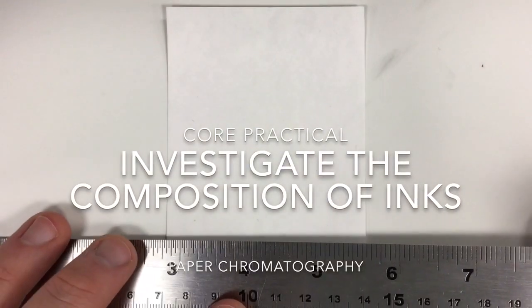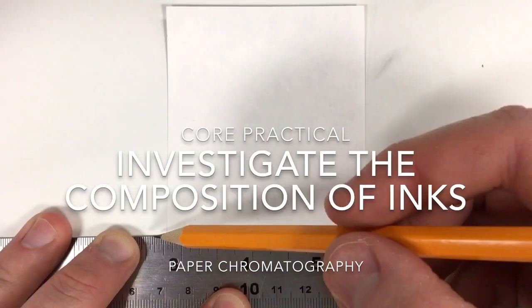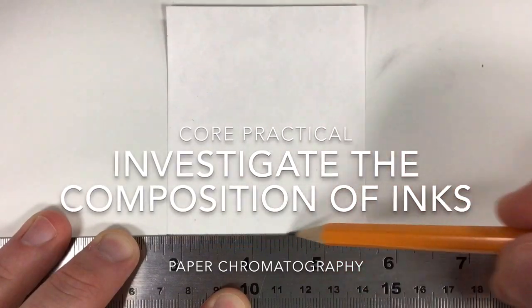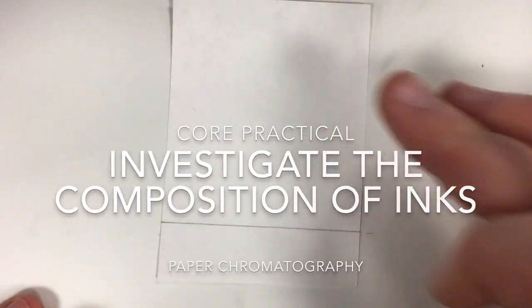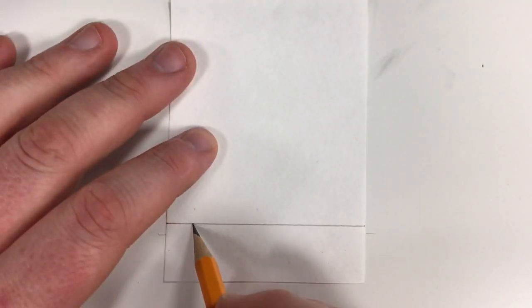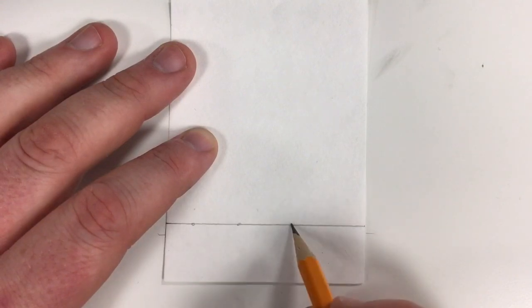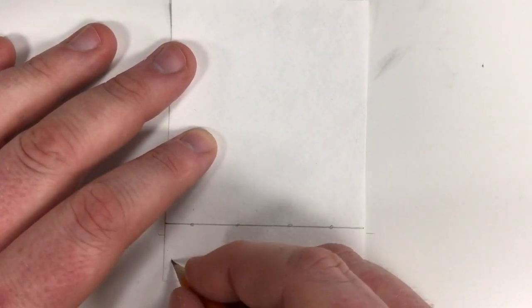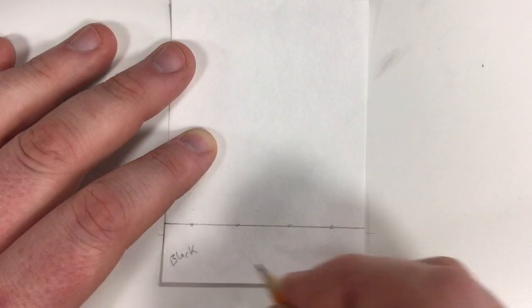In this experiment we will investigate the composition of inks using paper chromatography. Firstly we must define our origin by drawing a line using a ruler roughly one centimetre up from the bottom of the chromatography paper. This must be done in pencil as the pencil is insoluble in the water solvent.